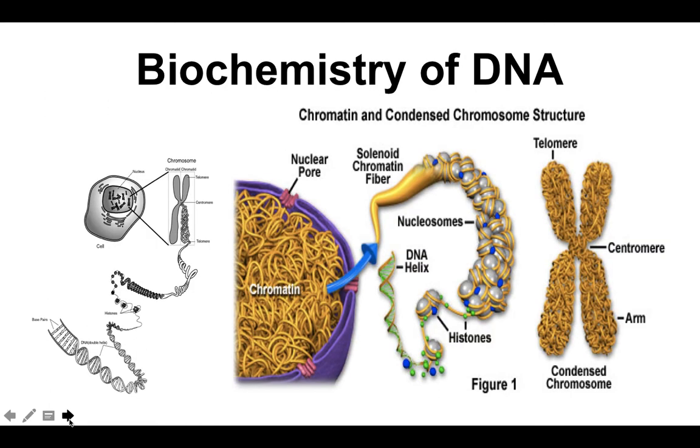Okay, so some preliminary concepts that we need to discuss. Of course, it's important for us to understand the nature of the molecule that we are dealing with, the DNA. So, a little about the biochemistry of DNA. DNA serves as the information carrying biomolecule for living organisms. Before engaging in any attempt to isolate DNA, one must understand how it is packaged at the cellular level.